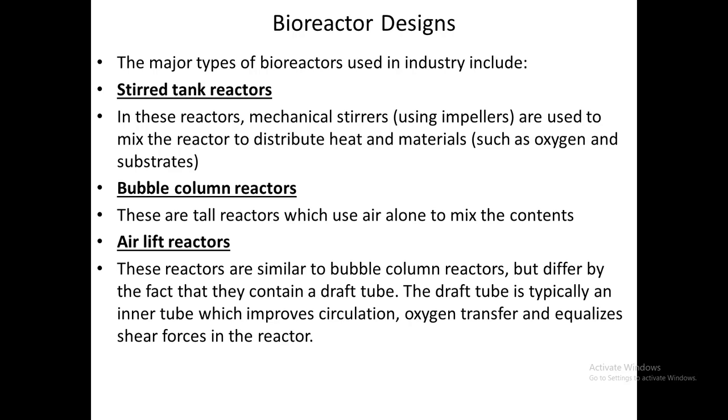The stirred tank reactors: in these reactors, a mechanical stirrer using an impeller is used to mix the reactor and distribute heat and material like oxygen and substrate. Bubble column: these are tall reactors which use air alone to mix the contents.